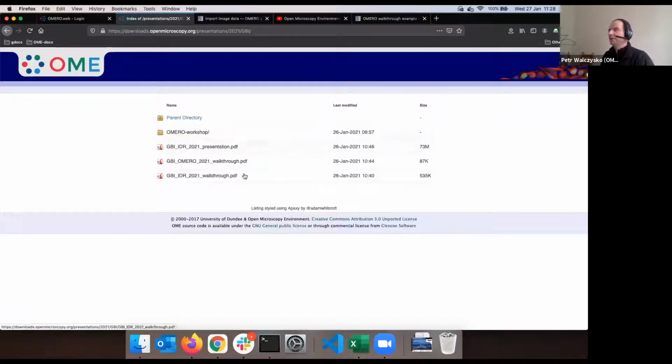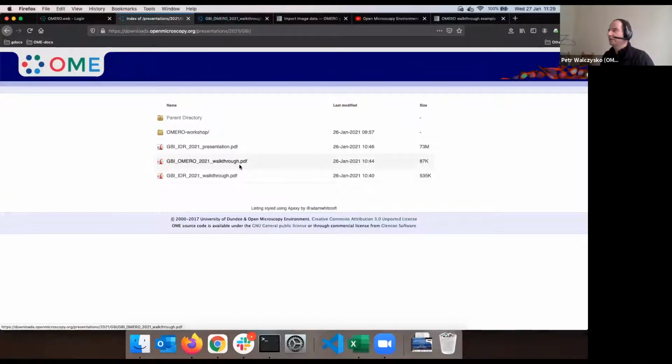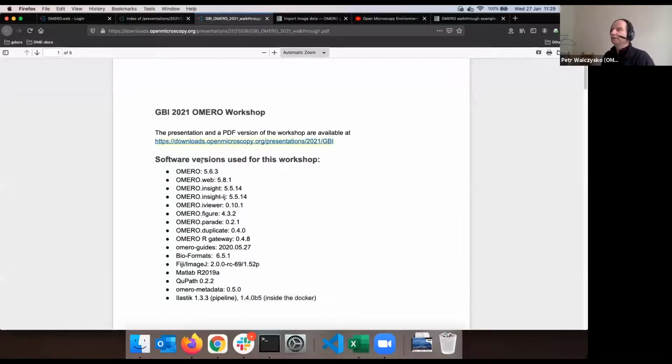Yeah, ladies and gentlemen, are you there? I will leave a couple of seconds for you to find your footing, because I myself had to have them. So this shows that this is necessary. And what we are concentrating on is the third item here, GBI Omero 2021 walkthrough PDF. Yes, you got it, ladies and gentlemen. If not, then tell me or scream, because that is your lifeline. Okay, I'm opening that in a new tab, and that's what you should be seeing.